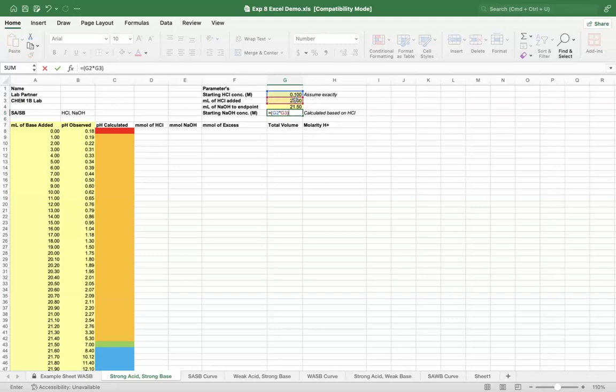Those moles of acid are equal to the moles of base if we got to the neutral point. So right there, I have the moles of base. If I divide that by the actual volume of base, the 21.5 in my case, or the amount that it took for you guys, then this calculation gives the concentration of base.